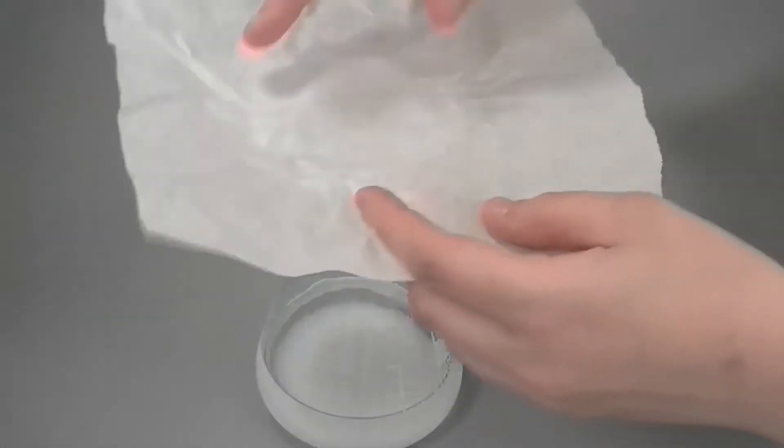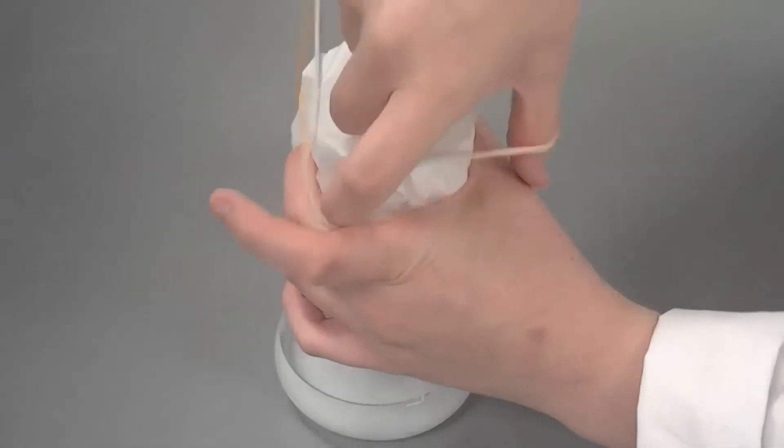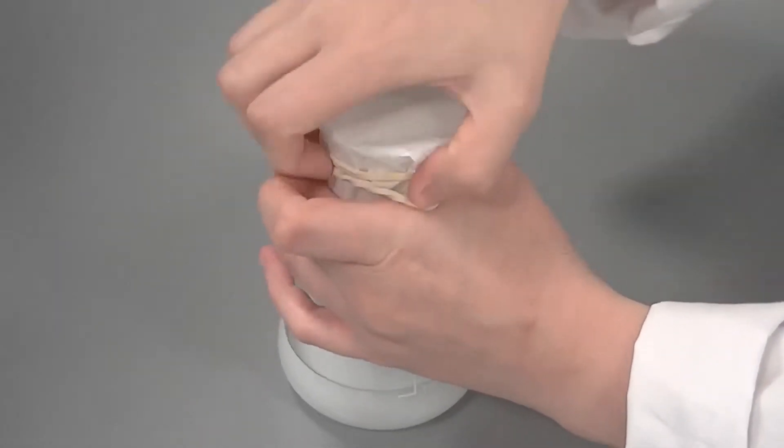Cover the top of the flask with greaseproof paper and seal with an elastic band. This is to prevent evaporation when microwaving.